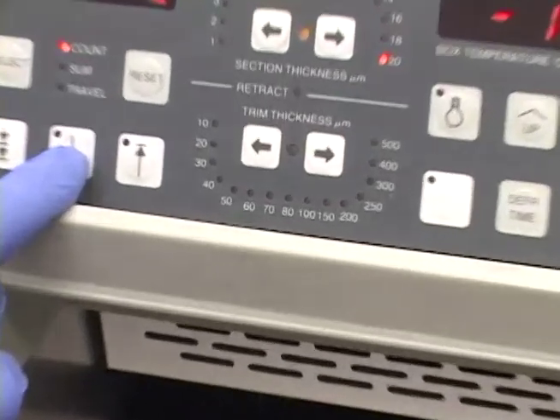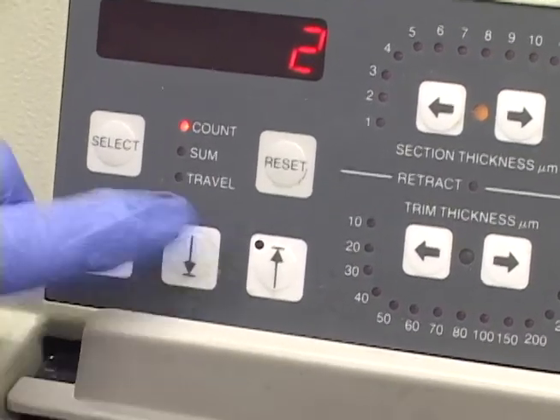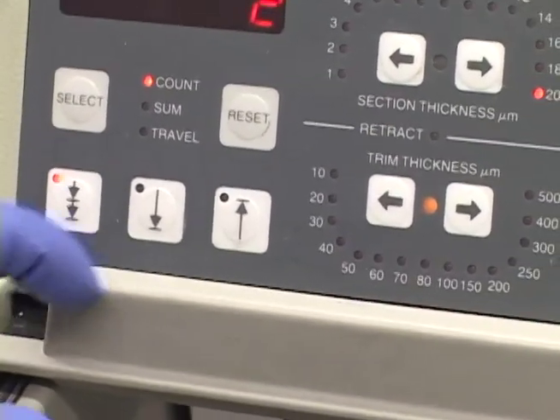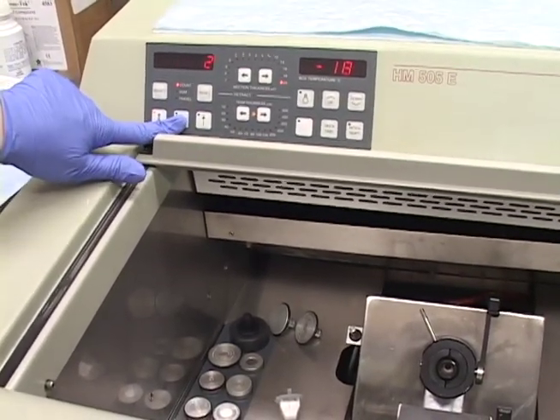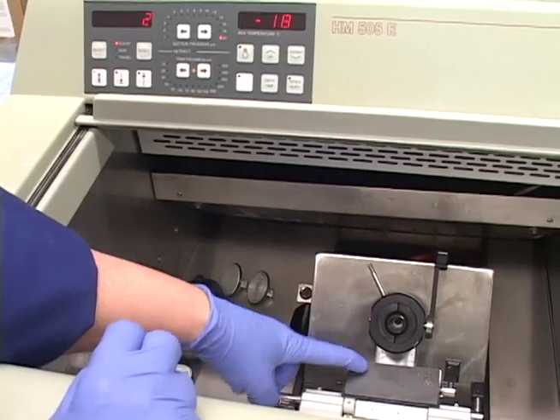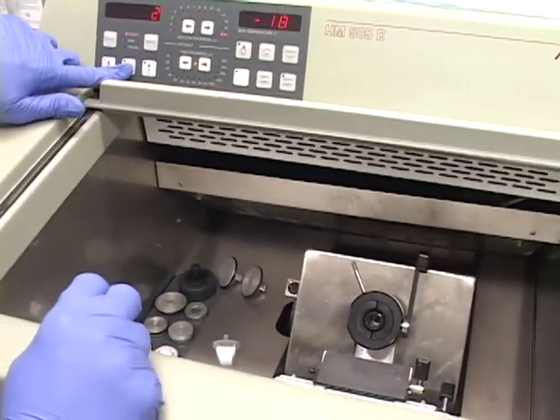This is bringing it forward. Now if I want to fast forward it I can push this. That's telling me it's going to fast forward or fast reverse. You want to be really careful with that because you don't want to bring your sample or your chuck head too fast and actually hit the knife plate. You'll damage the knife plate and possibly damage the chuck holder — that could be quite expensive.